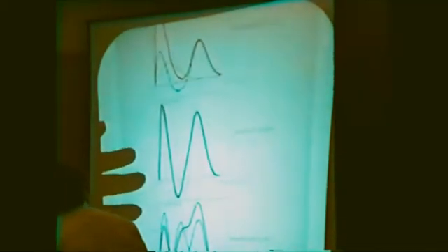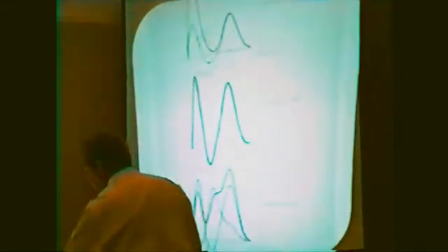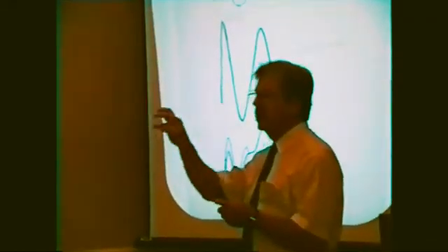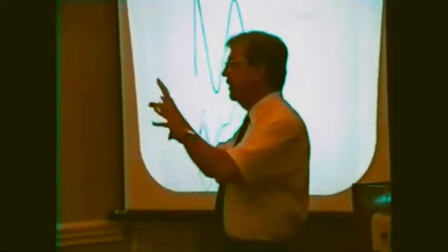This is the abstract. Here is a lower concentration of water, exactly the same concentration of water as you have OH groups, and this is the second line corresponding to the residual concentration. And I don't have enough time to talk about it, but for each case it's possible to give not only the concentration of the different species, but also the distance inside each group, and the average distance between the different magnetic configurations.